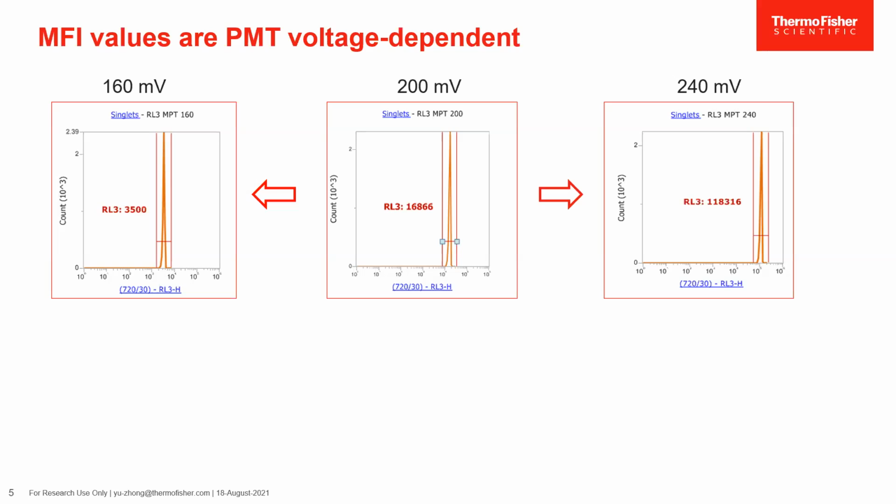So this example, I think, tells us again that an advanced fluorescent technique like flow cytometry demands quality at every level. Not just specimen preparation, fluorophore selection, and panel building, but at the final step of our very long experimental protocol, the data collection is critically dependent on the instrument.